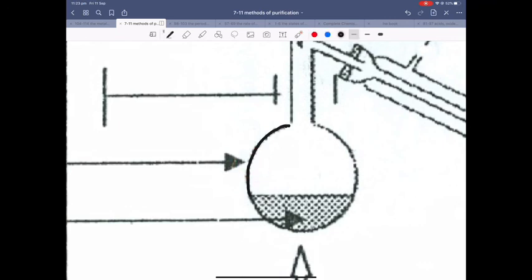There should be no gaps. The label should be touching the item. The other mistake, which is even more serious, or just as serious, is that there's a gap in the apparatus itself. There should not be any gaps in those types of pieces of apparatus. Otherwise, if there's a gap, the substance inside is going to escape, or leak, and pour out, and so on and so forth. That's what it means.